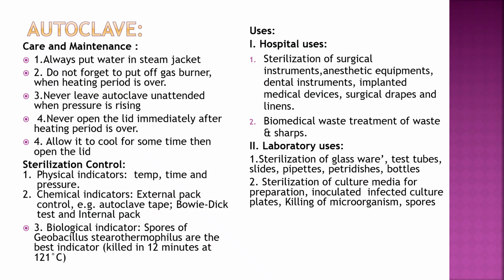The care and maintenance of the autoclave. We have to always put water in the steam jacket. Do not forget to put off the gas burner after the holding period is over. Never leave the autoclave unattended when pressure is rising, and never open the lid immediately after the heating period is over. We have to allow it to cool and then open the lid.